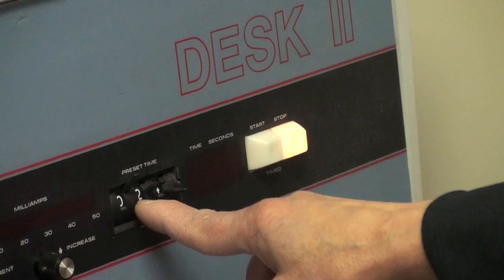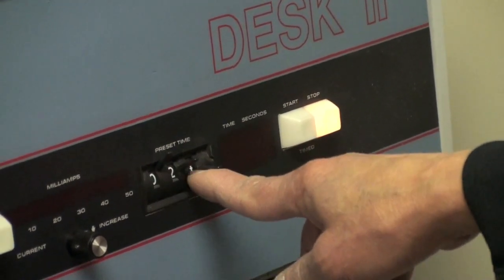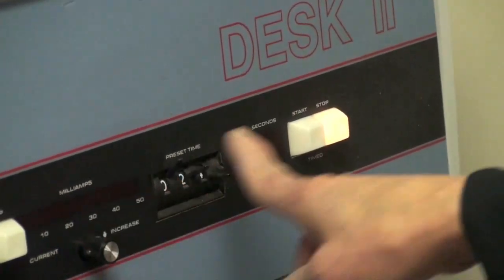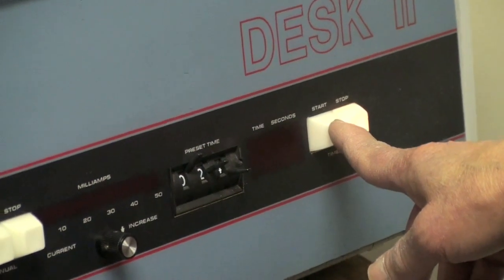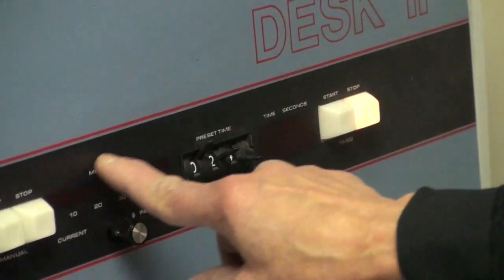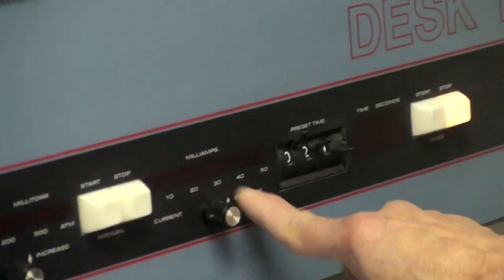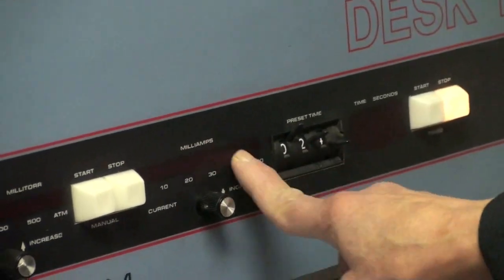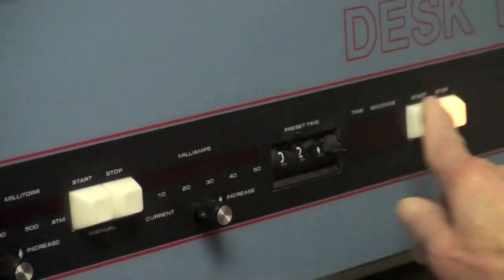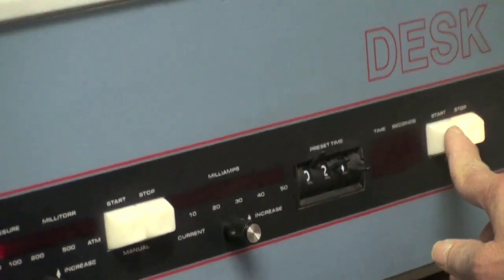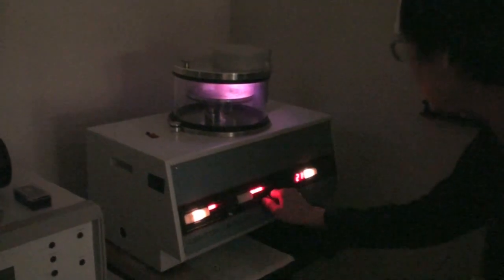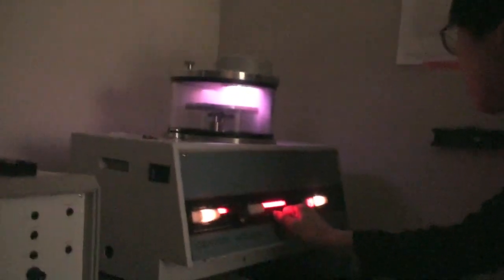So the next step is we're going to start it automatically. So it's going to time it start counting down from 24 to zero. And once you hit this start button, you have to increase the current to the cathode to 45. And that is the plasma.